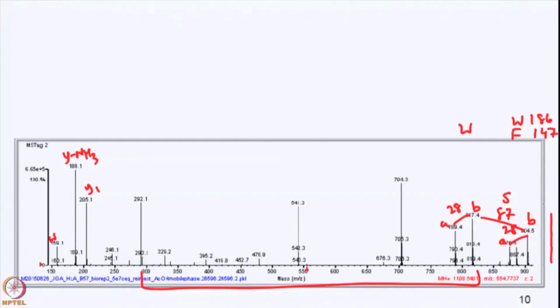All right, I'm going to add an extra peak here. This is 1108. And the mass difference there is 204 minus 18, 186. So our tryptophan is at the C terminus, sorry. All right, this mass gap is 113. So that would be leucine.